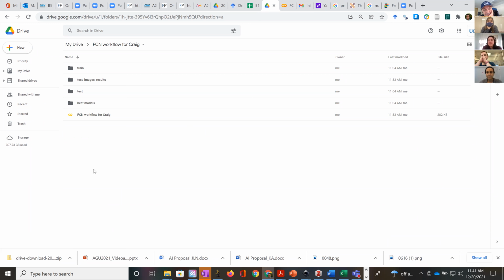Yeah, after let's say using Devin's code, we can definitely get any volumetric values we're interested in, because we can get area, perimeter for every different tissue, and everything is calculated per slice, which is super helpful here. We can have an average, we can look at each slice individually, and then based on the resolution, you can calculate the volume. So basically you can have porosity and also mesophyll volume and mesophyll tissue. And with the perimeter, you should be able to actually calculate the surface area as well.